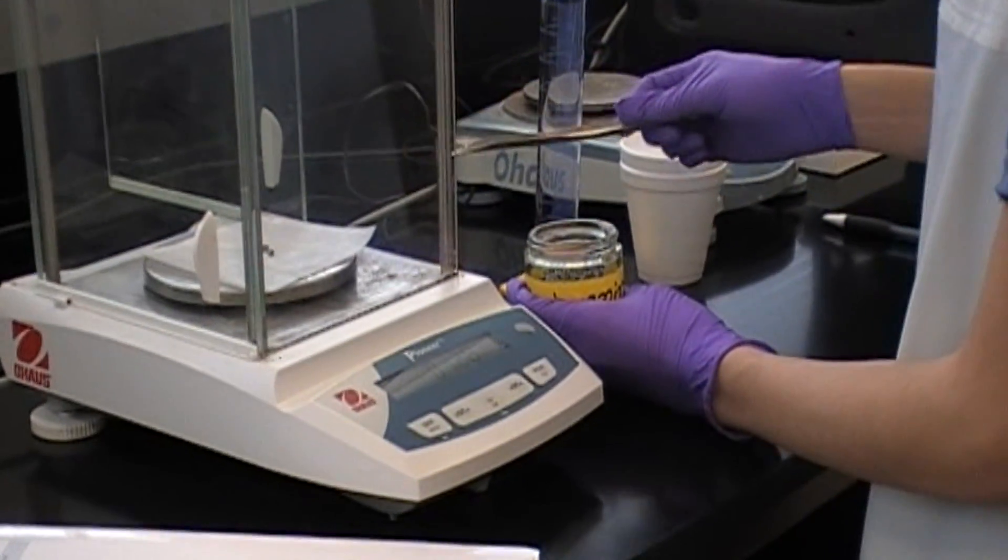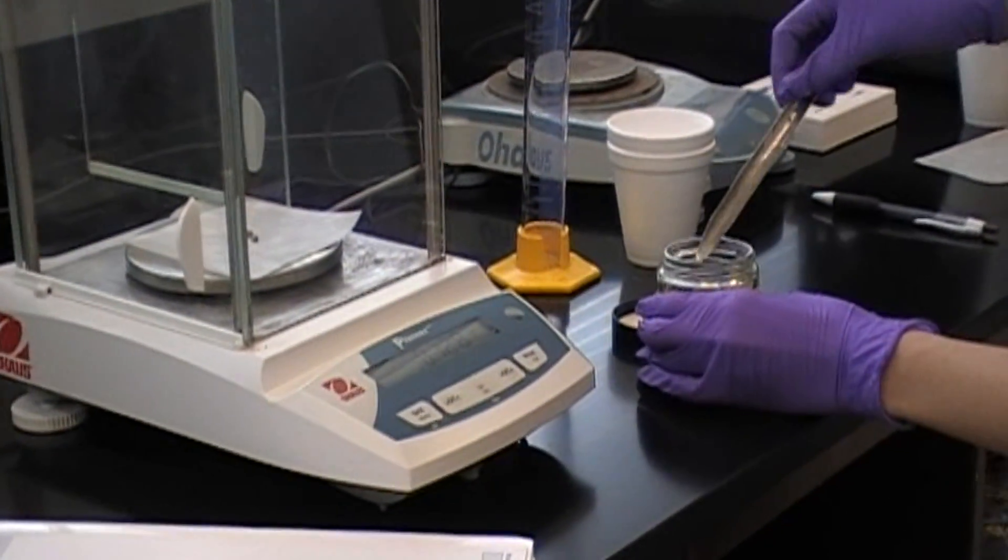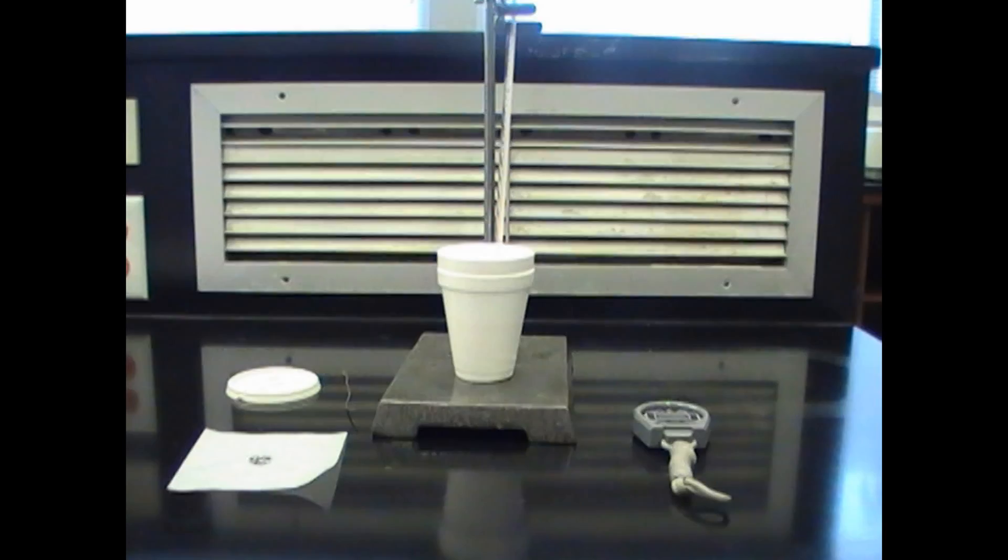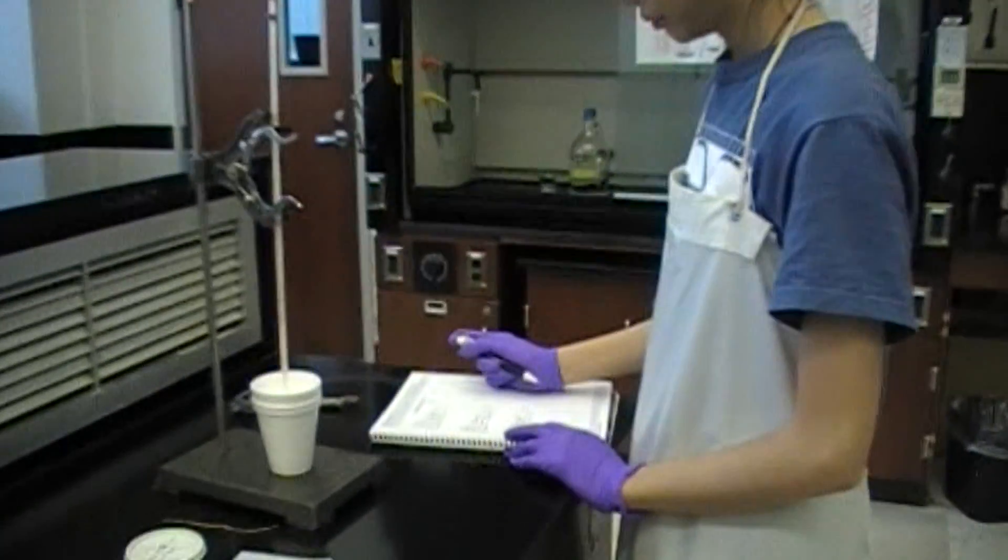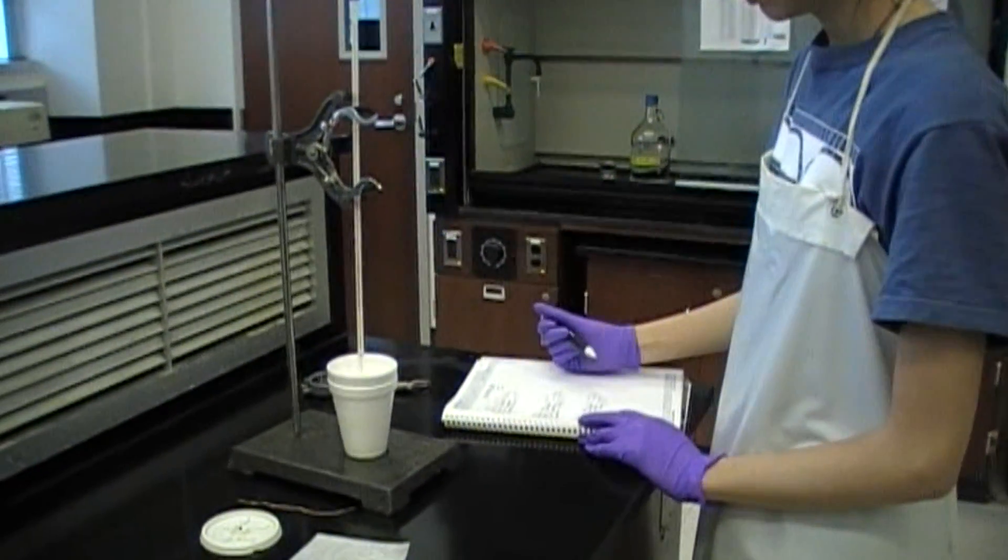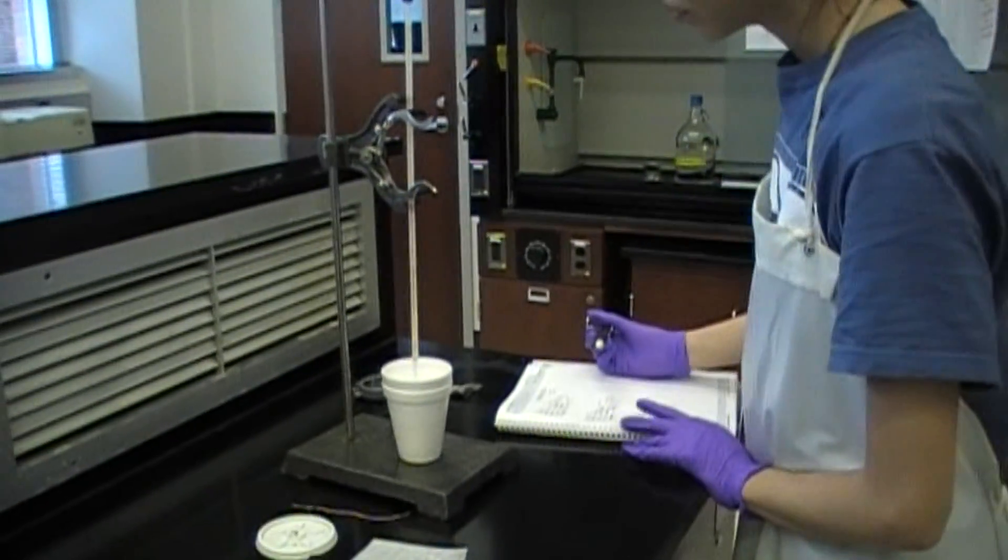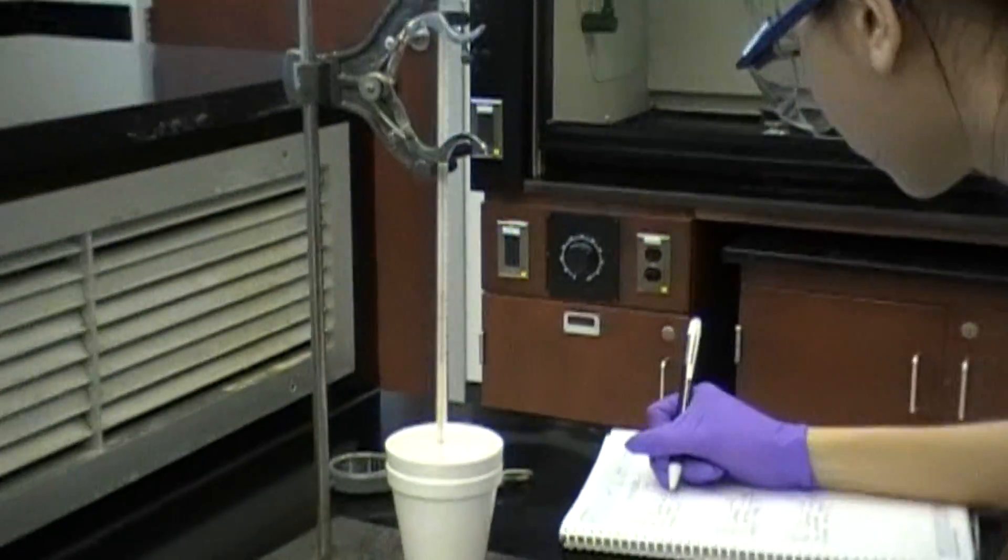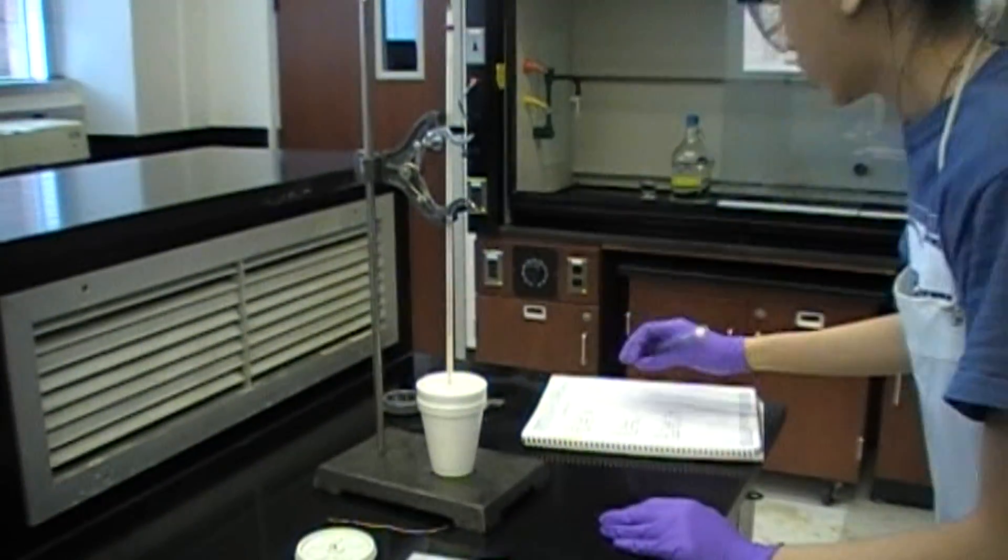Now, also pre-weigh your magnesium turnings. Once you have pre-weighed your magnesium turnings, record the temperature of your calorimeter, and wait five minutes, which will be the latent period. This will be your initial temperature.